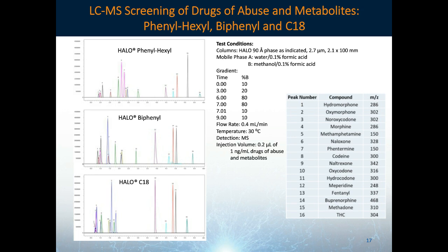You can see that there are some selectivity differences across these three phases, and the Halo phenylhexyl is able to resolve more of these drugs of abuse and metabolites.